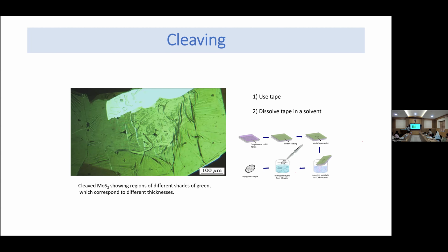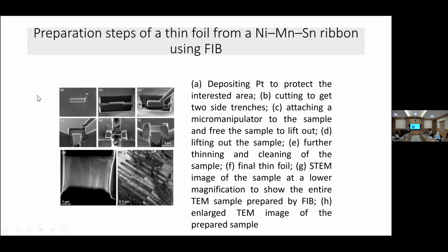So in that case, we use focused ion beam milling. Like we can cut the surface like this. So this is the surface. We will cut like this and analyze.